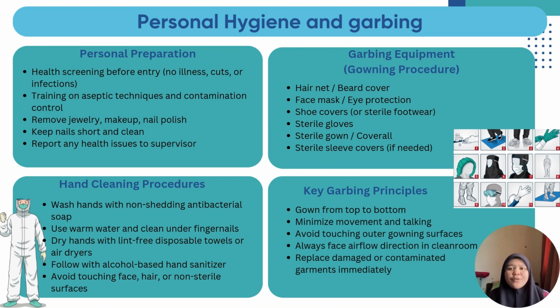Following this, hand hygiene plays a critical role. Personnel are required to wash their hands thoroughly with non-shedding antibacterial soap and warm water, paying special attention to the area beneath the fingernails. After drying with a lint-free towel or using an air dryer, alcohol-based sanitizer should be applied. At all times, contact with non-sterile surfaces must be avoided.